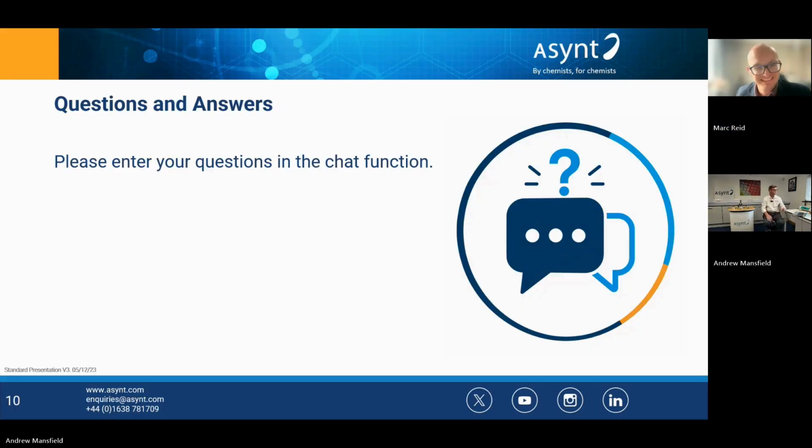Right. I mean, we've only got a few minutes left. Okay. But there was a question that came in earlier. Can Kineticolor monitor a live video input and output signals for controls? For example, add a reagent, wait until mixing is complete, take a sample.